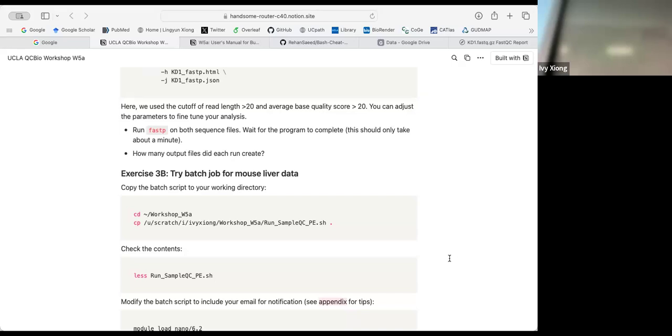If you didn't make it, you run it in the home directory, the workshop directory, as a temporary solution. Otherwise, you have to specify in the code. I did it in the other one as well, but it didn't generate anything, even though it seems to have run fine. Maybe you have the same issue.